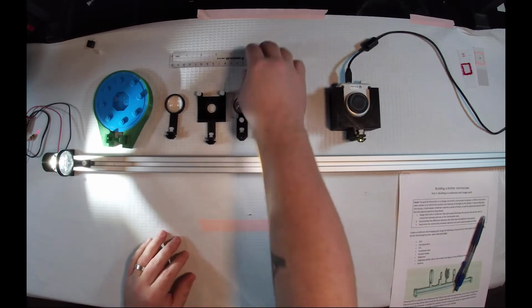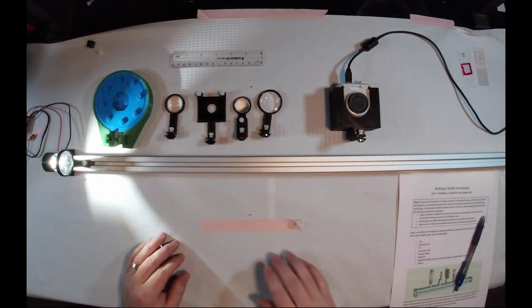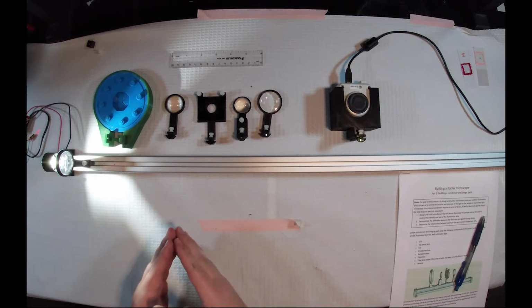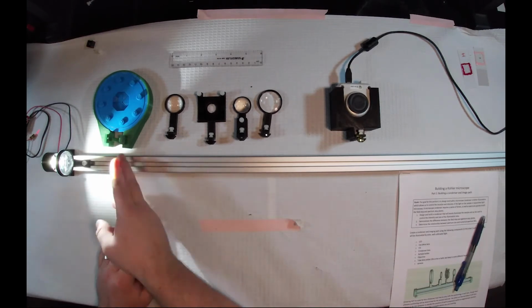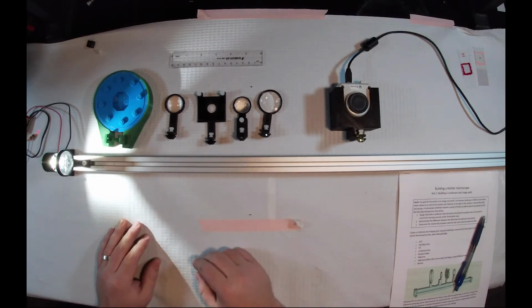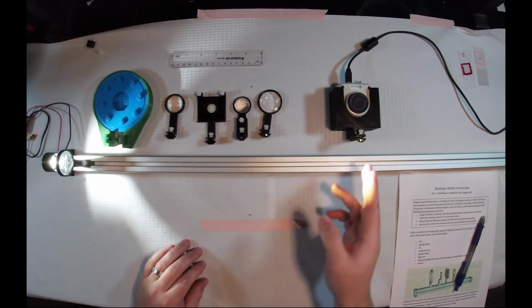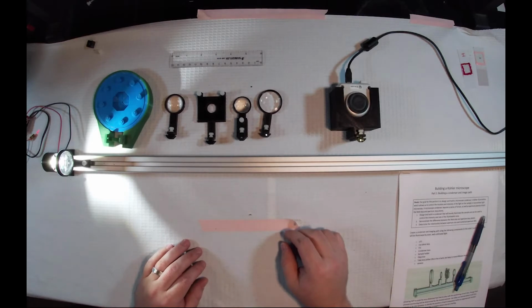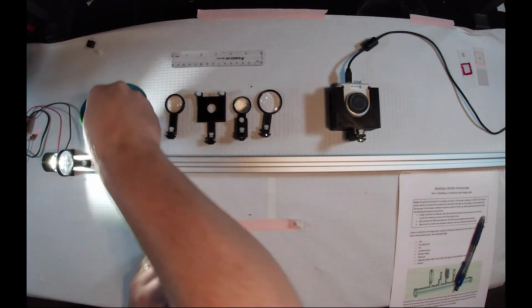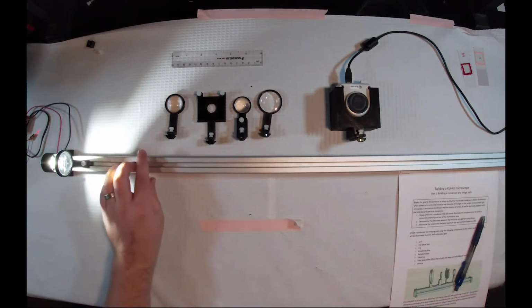So what I have already done is I already have a nice collimated light source. The LED is focusing to a very far distance away. So we are going to be incorporating the iris. We're going to have a condenser lens for the first time. We have our sample holder. We have our objective lens and our tube lens that we used last time, and we also have our camera. So I'm going to be assembling this microscope in this order. We are going to be able to move this iris back and forth to sample different focal planes.